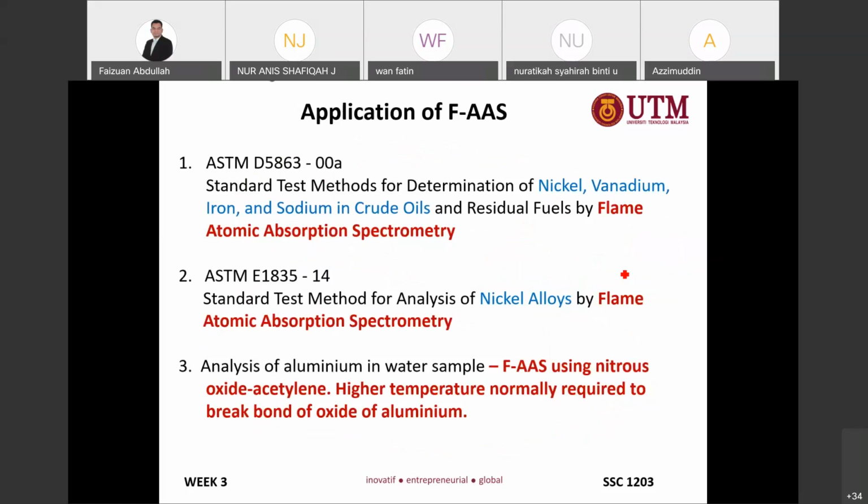Application of flame AAS, we have a lot of applications. We have a standard test method for nickel, vanadium, and so on in the crude oil. You are a petroleum engineer, right? So how to detect the metals inside the crude oils? We use AAS, only flame, to detect nickel, vanadium, iron, sodium in crude oil and residual fuel by flame. And then we have a standard test for analysis of nickel alloy by flame. We have a standard method for the analysis of aluminum in water sample.